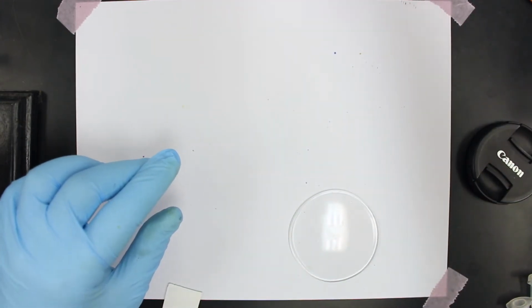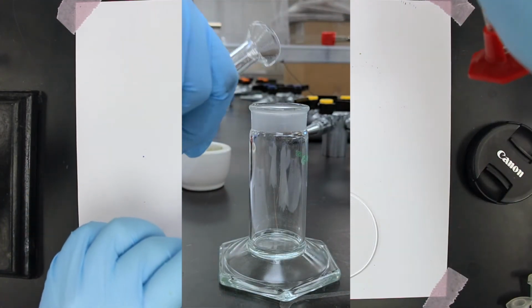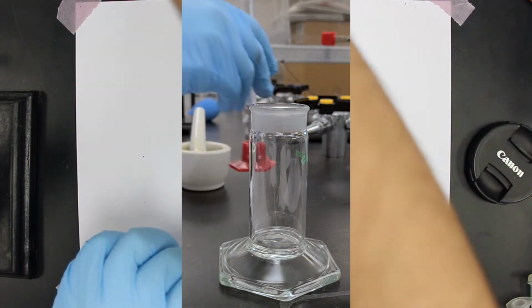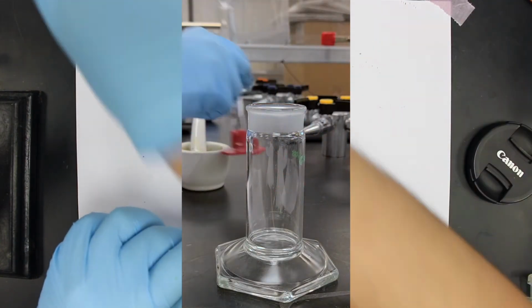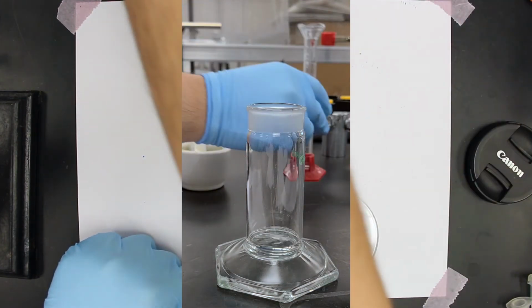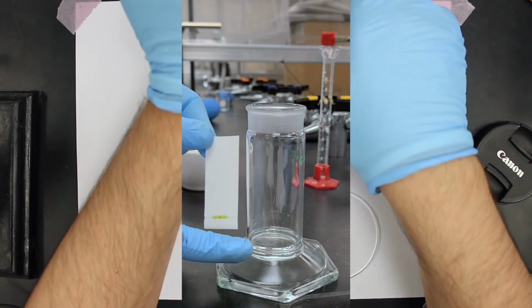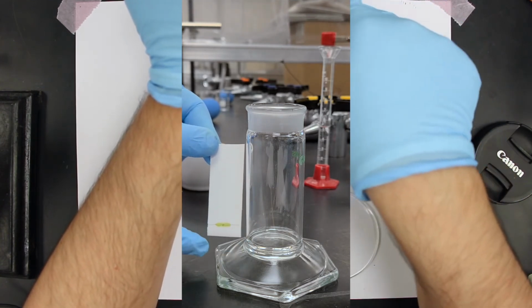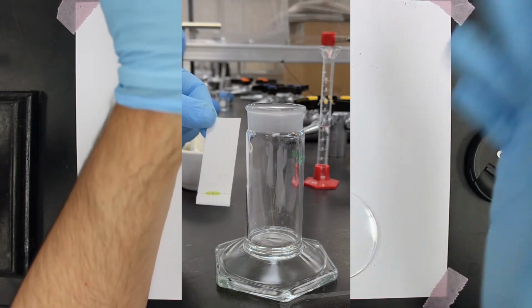So we've got our TLC chamber here. I'm going to place some solvent into there, so you don't want to put too much. This is an interesting mixture. It's made to separate the pigments in leaves, so what exactly it is not too much of concern. There's actually 5 different solvents in here. Now, when you develop your plate, it's important that the level of the solvent here does not exceed the level of the origin here, because if this solvent is higher than this origin, the sample will simply dissolve into the mixture, into the chamber, which is what you don't want.